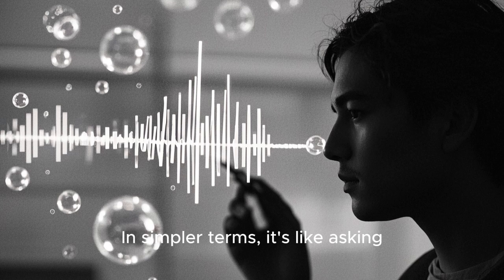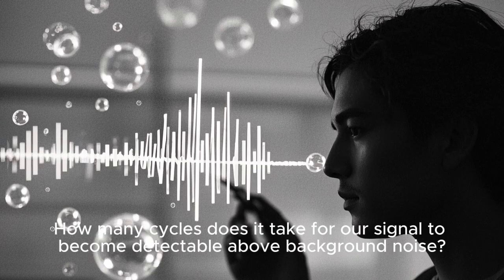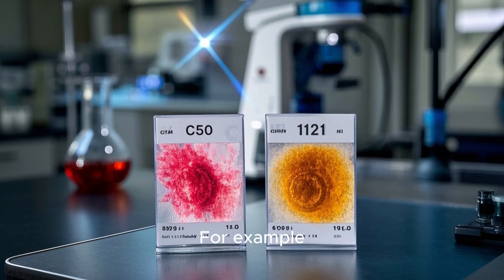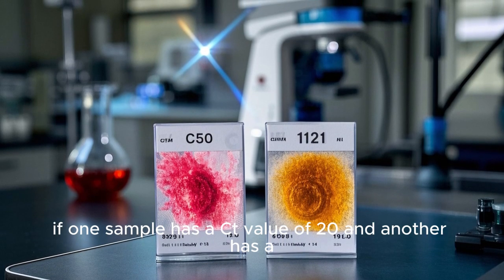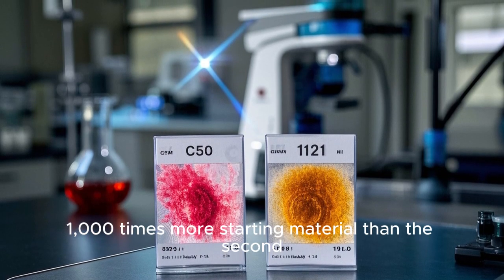In simpler terms, it's like asking, how many cycles does it take for our signal to become detectable above background noise? The lower the CT value, the more starting material we had in our sample. For example, if one sample has a CT value of 20 and another has a CT value of 30, it means that the first sample had 1,000 times more starting material than the second.